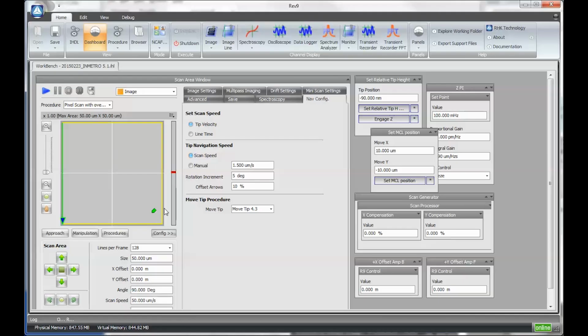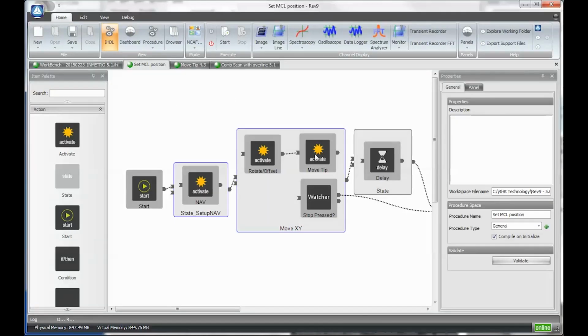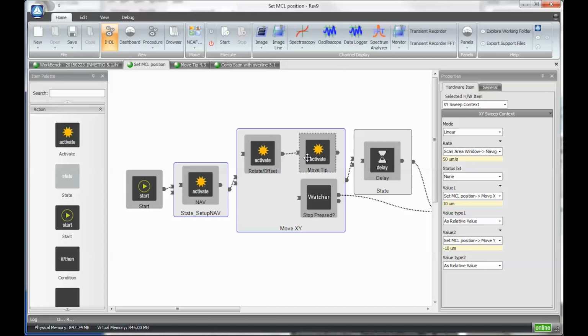So now we're rotated. So now you have to turn your head sideways to understand what X and Y are. So now if I'm going to move us in X, let's move us 30 microns in X, which now technically that'll be up, 10 microns. Oh, what I've done, I've actually run into a limit here. This is why I said it's important to pick values that have proper ranges.